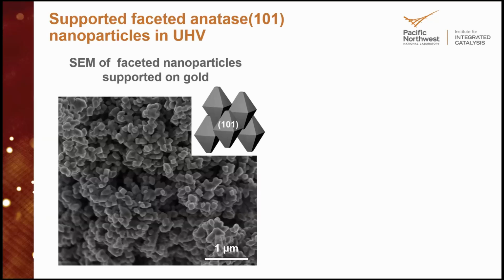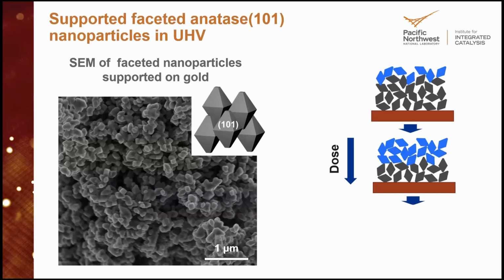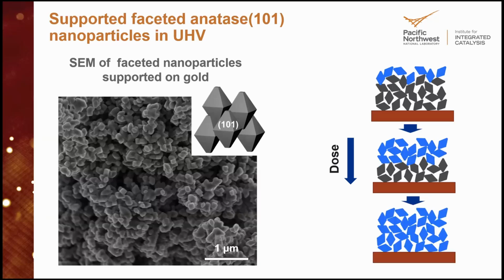And from a surface scientist guy who's always worked on single crystals, when they showed me this SEM, I was like, oh my God, we're going to do experiments on that. But it's going to be in the same chamber where we do the single crystal things, and that's the nice thing about it. And so the idea for the experiments was, well, you could take a sample like this, and now you could start exposing it to acetic acid or whatever reactant you want.